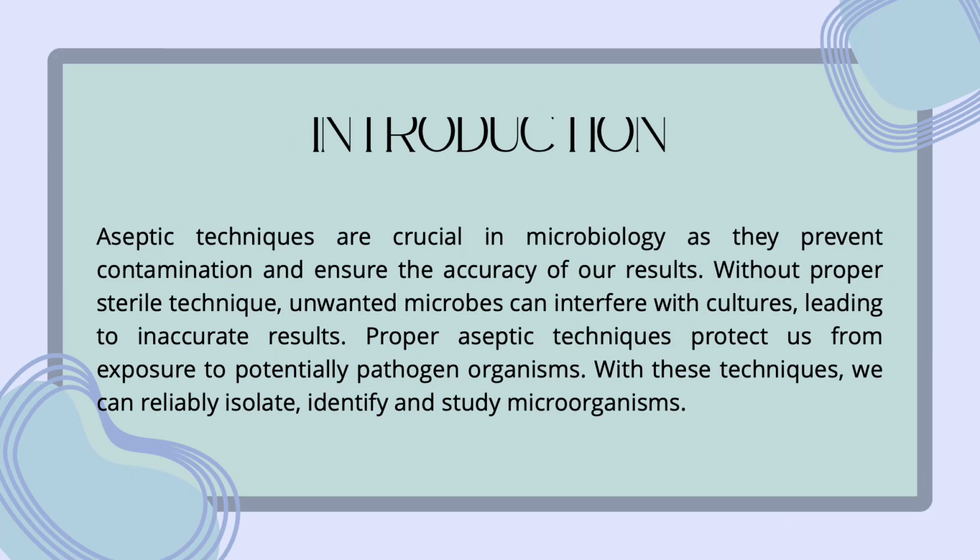Aseptic techniques are crucial in microbiology as they prevent contamination and ensure the accuracy of our results. Without proper sterile technique, unwanted microbes can interfere with cultures, which leads to inaccurate results. Proper aseptic techniques protect us from exposure to potential pathogen organisms. With these techniques, we can reliably isolate, identify, and study microorganisms.